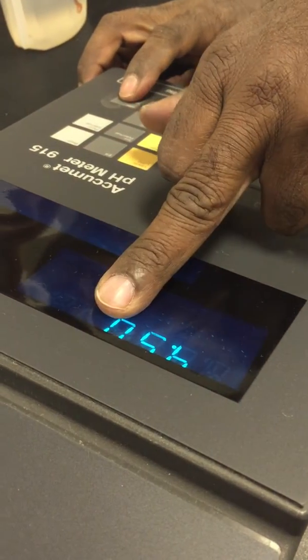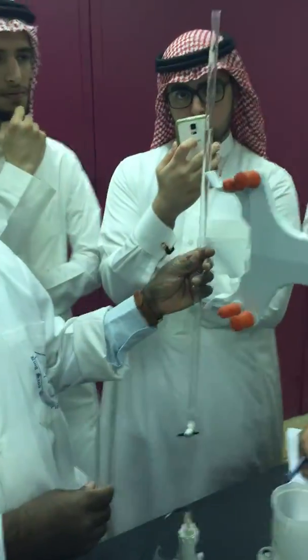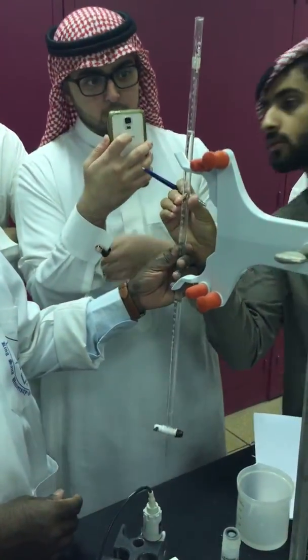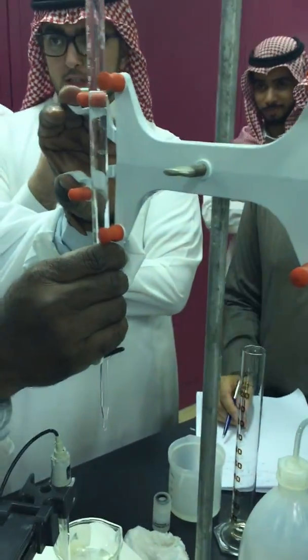4.5, don't bother here. 4.5, take it. Stop. And after this, you will take the reading. You will stop this and take the burette reading. For example, 7.3, right? 7.3.